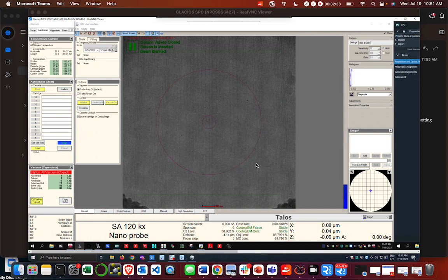So on the right-hand side, we have a filter scale that you can adjust once you're looking at an image in the TEM interface. You generally don't need to mess with that much. I never really do. And then below that, you have a rotating series of options. Right now, it is on the stage squared menu option, which shows you an overview of your position on the grid. And I'll show you how to use that later on, but then you have a series of options where you can directly do alignments or change a series of settings.